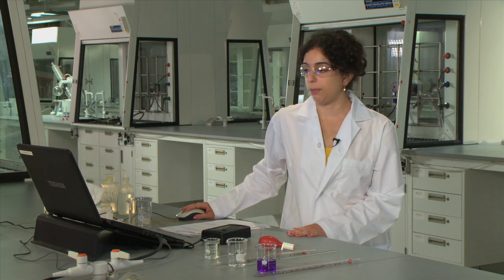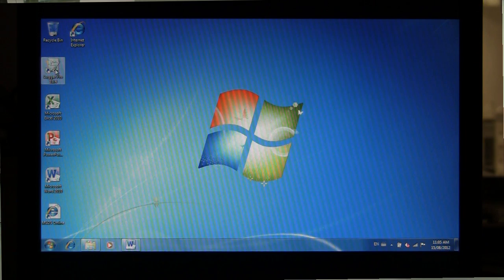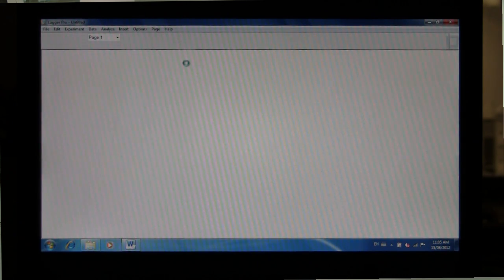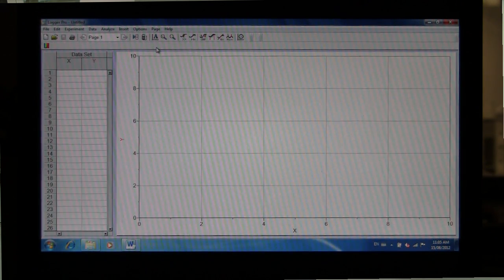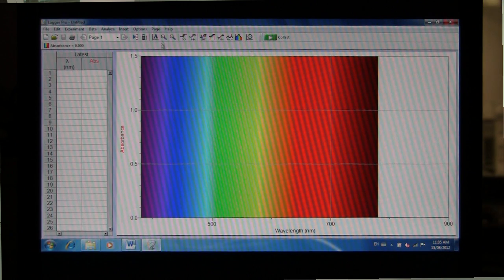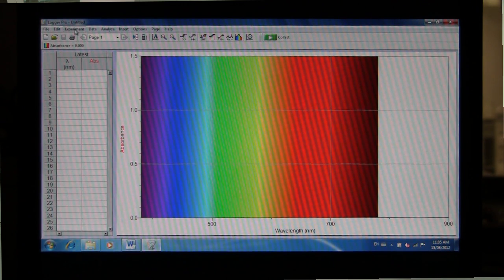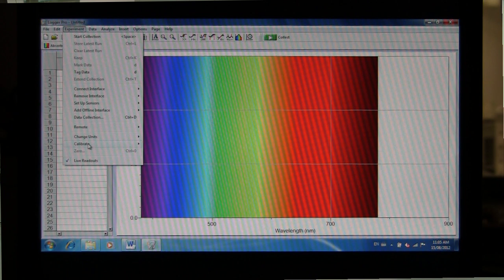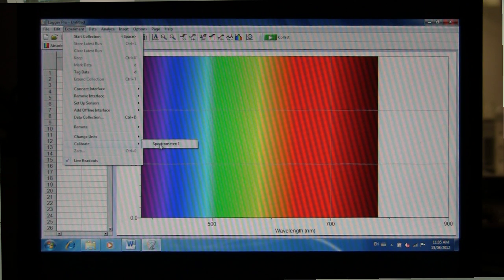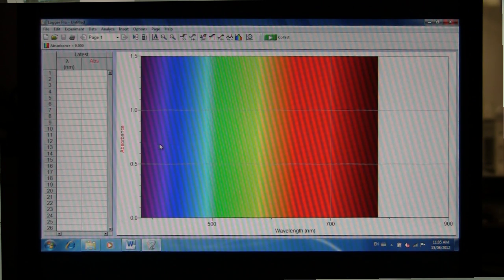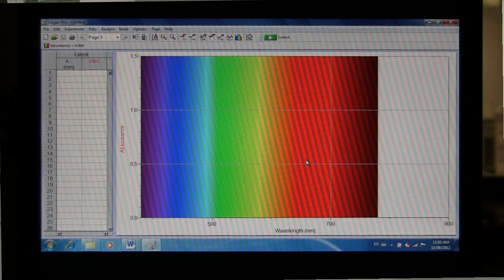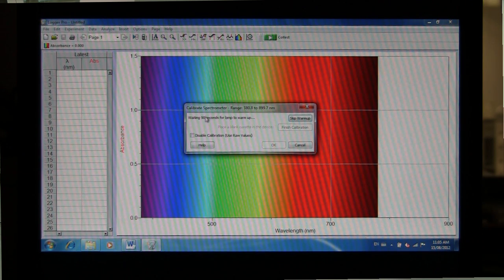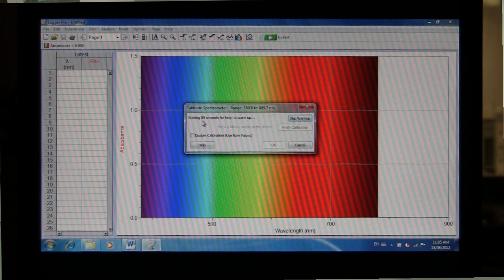At the beginning of your experiment, load the Logger Pro program, and we'll first need to calibrate the instrument. To do this, we're going to go into Experiment, and then select Calibrate and Spectrometer 1. The lamp will then warm up for about 90 seconds.